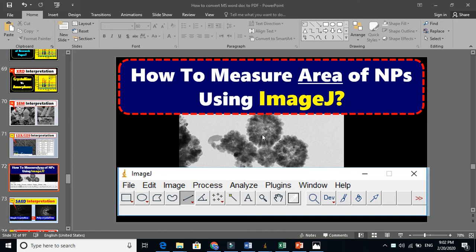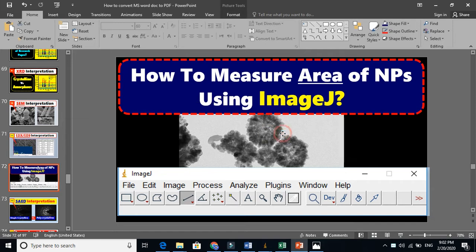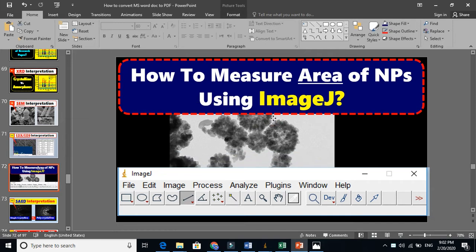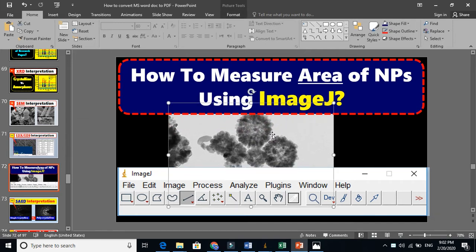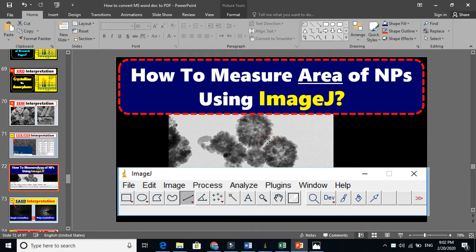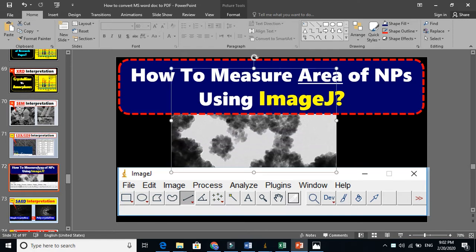If you are interested to find the area of this nanoparticle or microparticle, you can use ImageJ software.